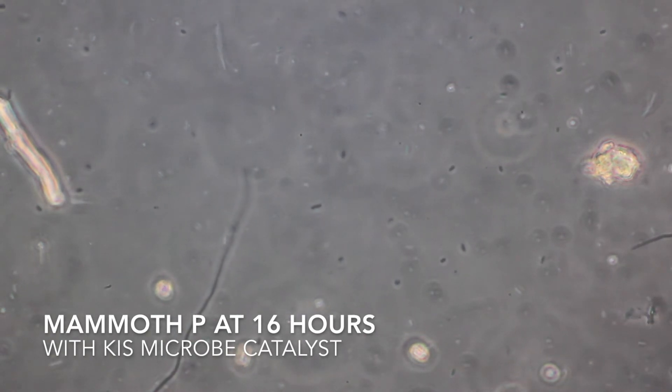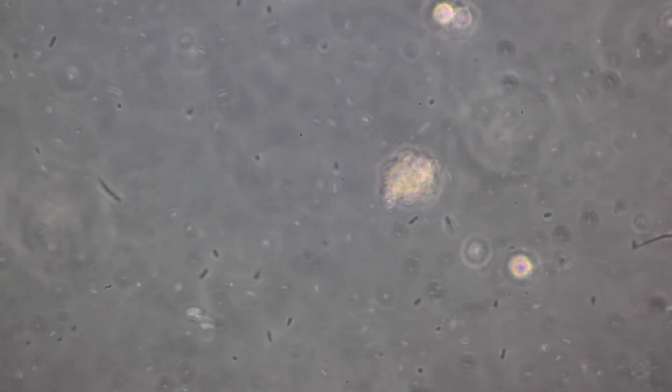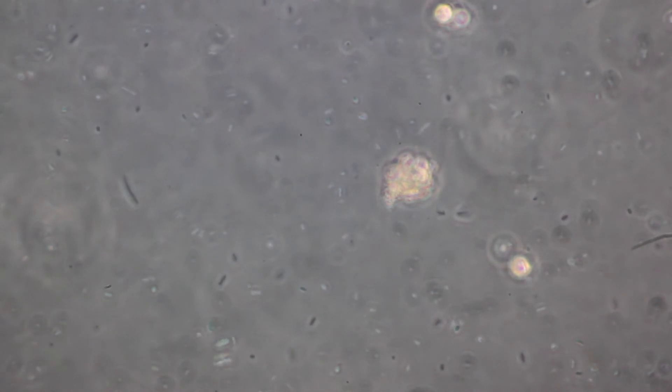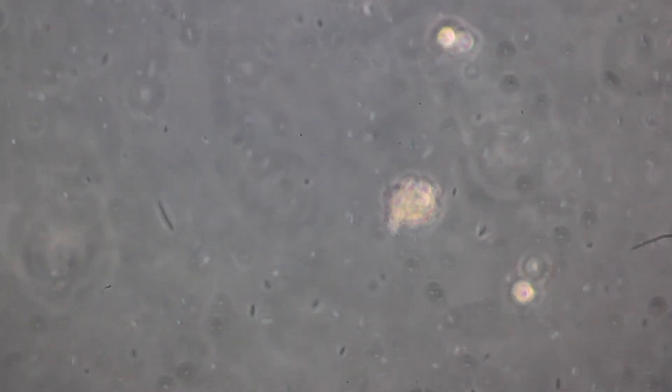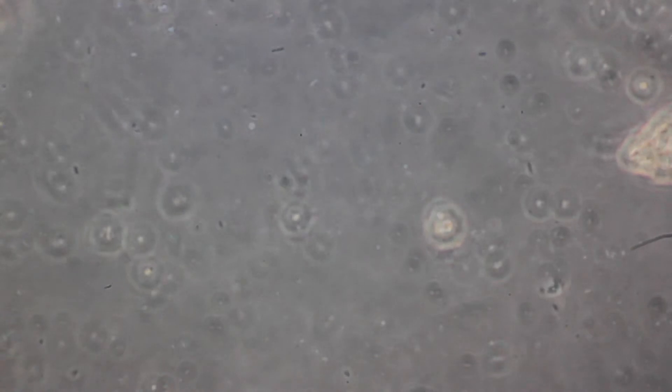We're back — this is the microbe catalyst added to the Mammoth P at around 16 hours in. You'll notice you have quite the same levels of bacterial growth as we had using the molasses, but what you do see is a much greater diversity of microorganisms, which is really what we want. We can't guarantee that the molasses is growing out all of the phosphate-solubilizing bacteria that Mammoth P is adding into the mix. With the microbe catalyst, at least with direct microscopy, we can determine there is a much greater diversity in morphology, which I find encouraging.